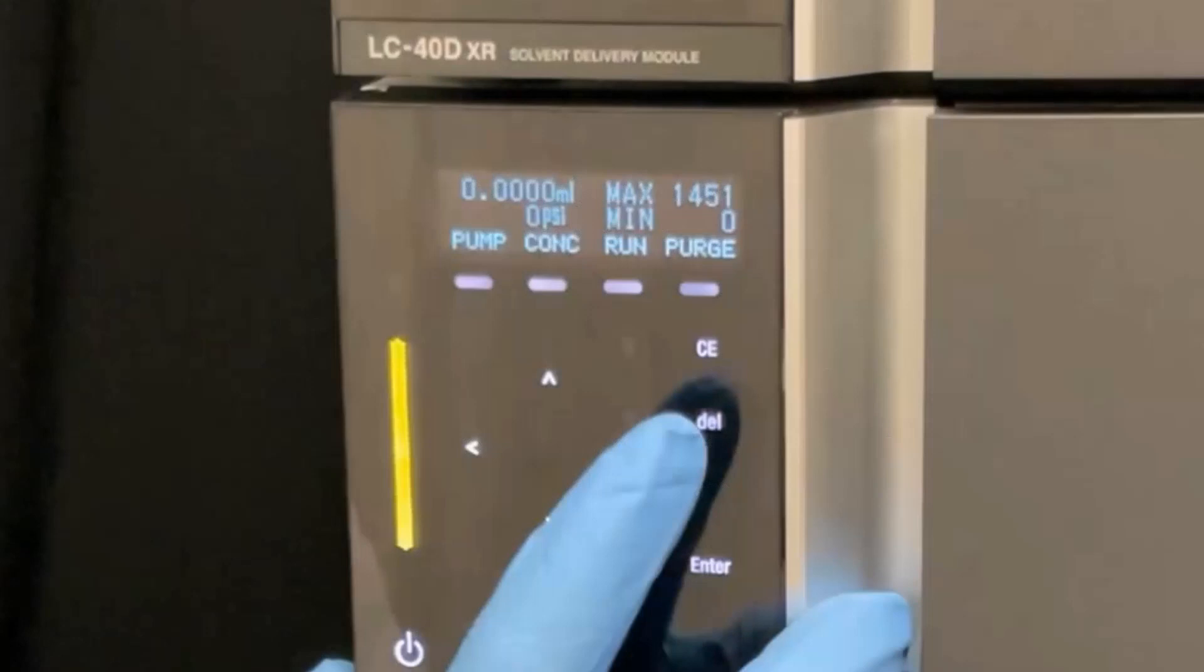First, set the plunger position using Pset. If you are not on the main screen on the display, you can navigate to it by pressing the CE button.